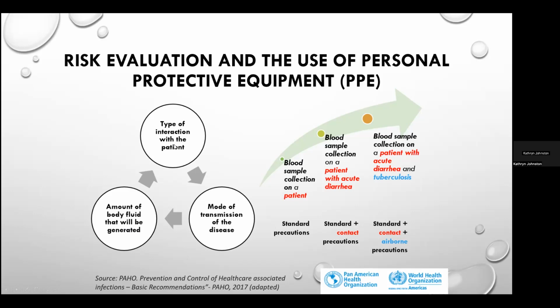So if you're doing chemistries, and so you're setting up the samples to put in the machine, then your interaction is going to be those that are related to the handling and management of blood, which is a potentially infectious material. So in order to prevent exposure to that blood, then you're going to be looking at standard precautions. You know all about them. So you might be wearing a gown. You'll be wearing gloves in the handling when you're opening the tubes.